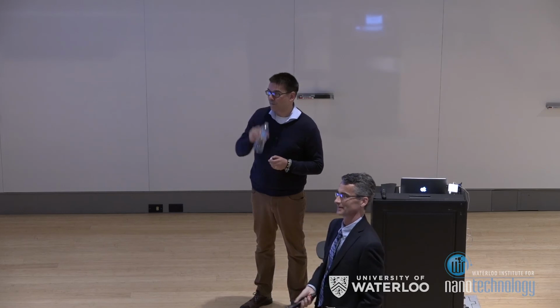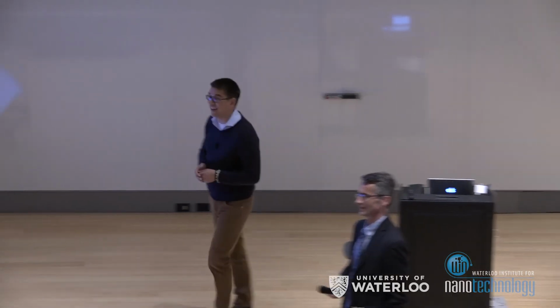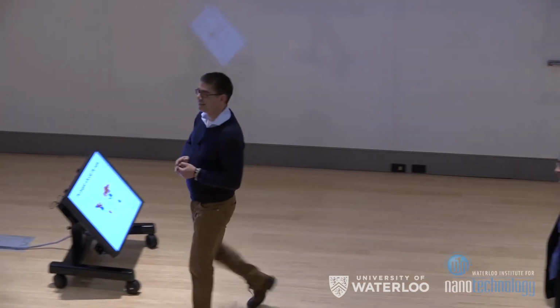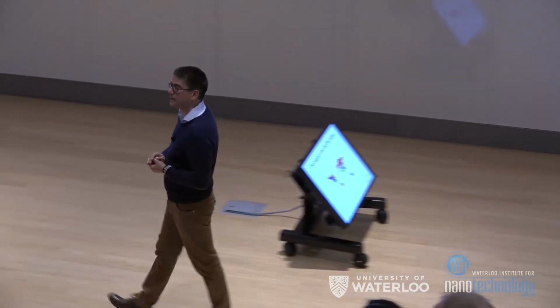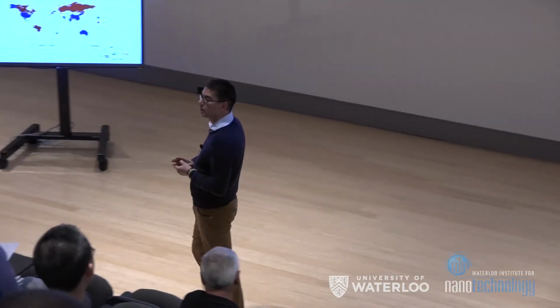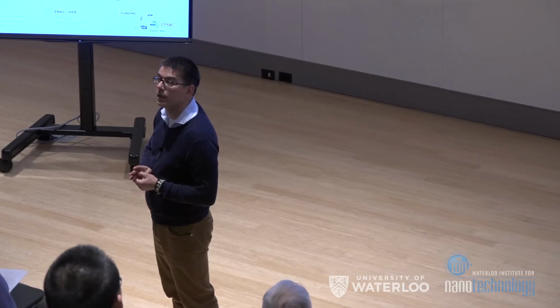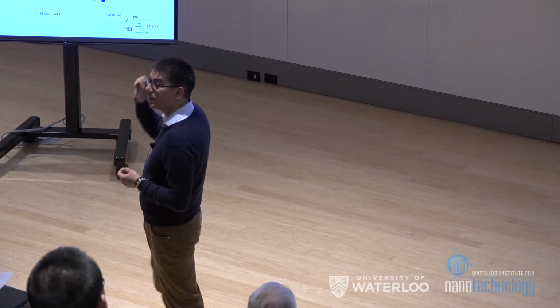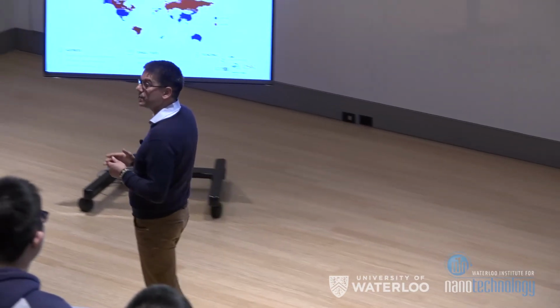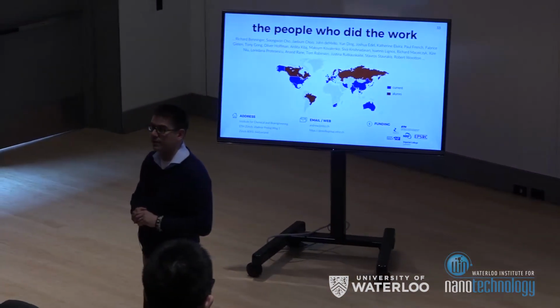Chris? Well, I was going just in case nobody else might, but quick question, I hope. You covered a lot of ground that was very interesting, but I can't resist asking, how are you doing your Raman analysis? From that second last slide there. So these are home-built systems. So it's not Raman. It's surface-enhanced Raman here for obvious reasons.